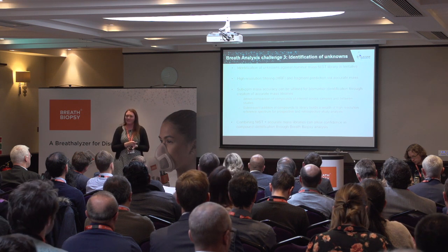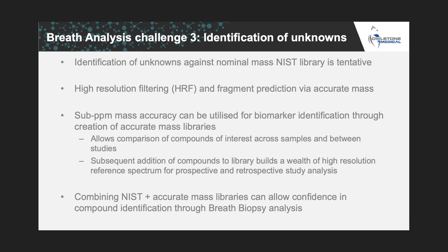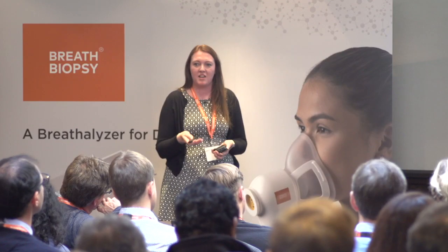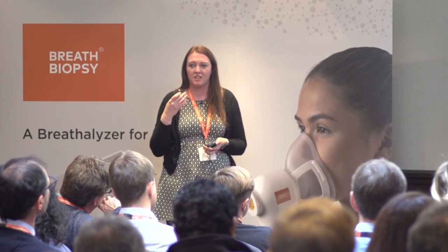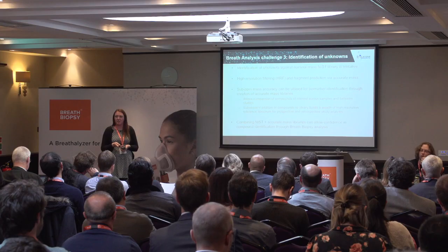All of that is so crucial to clinical interpretation because it's all very well and good to find a chemical, but as Olaf just demonstrated in the previous presentation, the identification is what becomes important for clinical interpretation. Just seeing VOCs go up and down in study groups isn't enough. You need to be able to try to interpret where they came from and if they could be part of the clinical interpretation of the study.